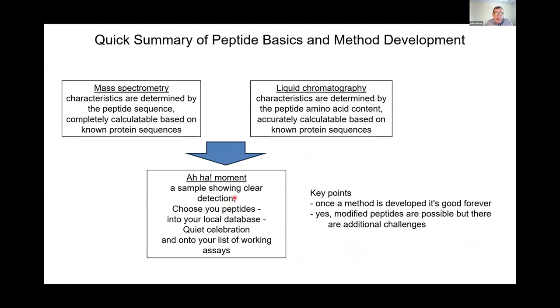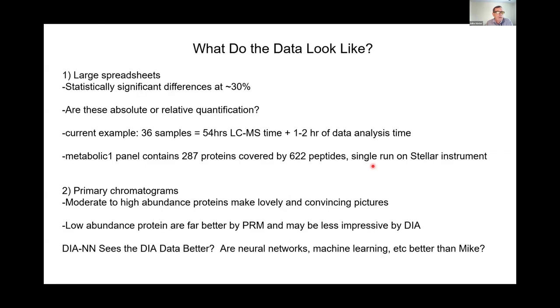We still need this aha moment, so there are some additional challenges in terms of the stoichiometry of the modification and whether or not some of those modification peptides are even detectable by the LCMS methods that we use.